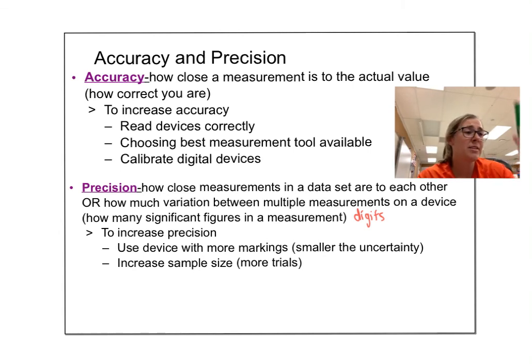If I say you need something less than 10, we would use this guy because there's better markings even than the graduated cylinder. So it's a measure of how much you are measuring. Something between 10 and 100, we would choose this guy. Something between 1 and 10, we would choose this guy. And also how many markings they have.